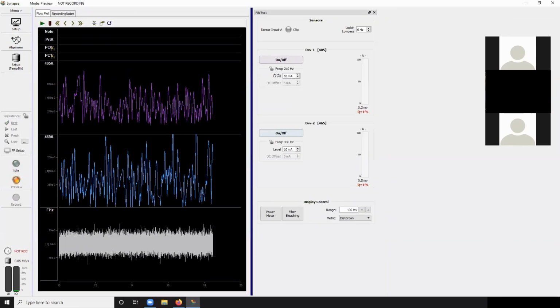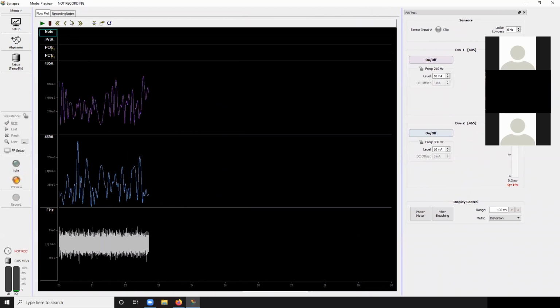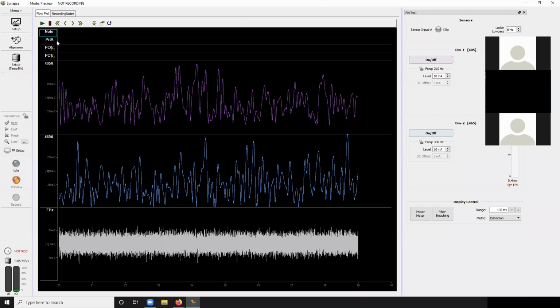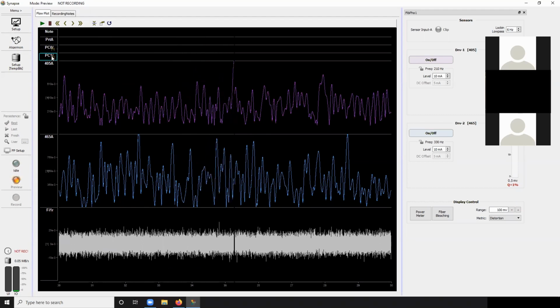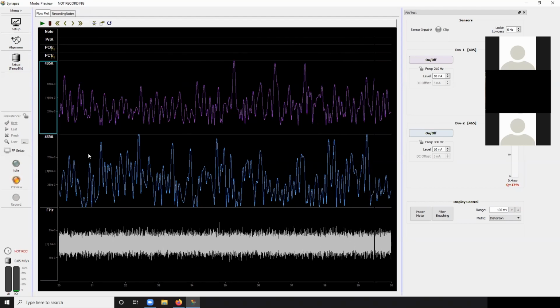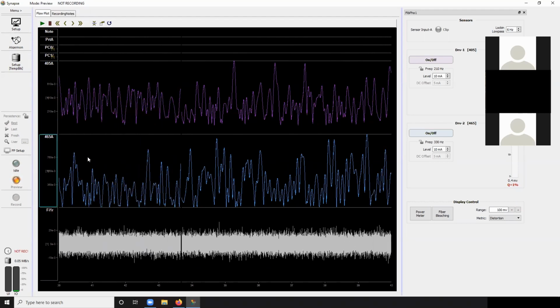So what I'm seeing over here is my note epoch. You can see my runtime recording notes, only available during record mode, but here are the preset buttons. That's my port A input for the digital IO. These are bits C0, C1. If you activate all the bits, of course, you'd see more. This is my demodulated 405 signal. This is my demodulated 465 signal.